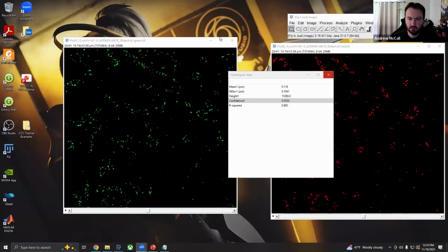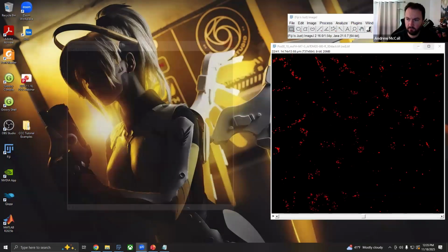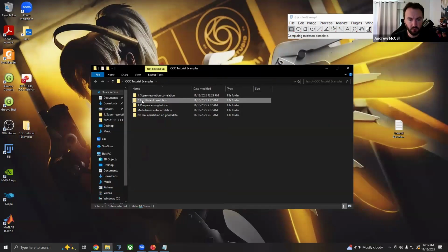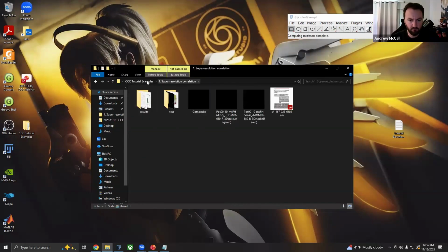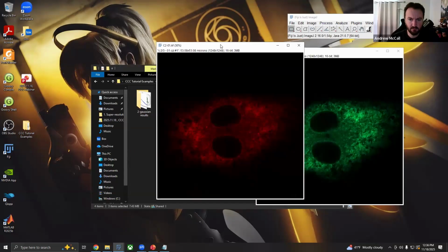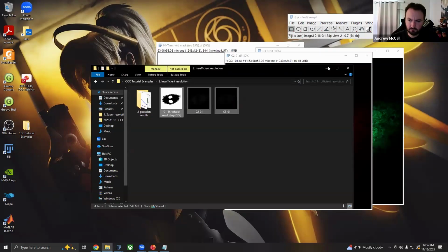All right. So we'll go ahead and move on to the next result, next example. If you are unable to analyze these for memory reasons, I did put all the results, at least the basics of them, into the folders here. Hopefully everybody's having success with this. The next result does have a mask, so you will need to drag and drop the mask.